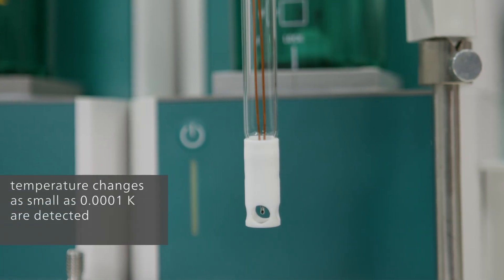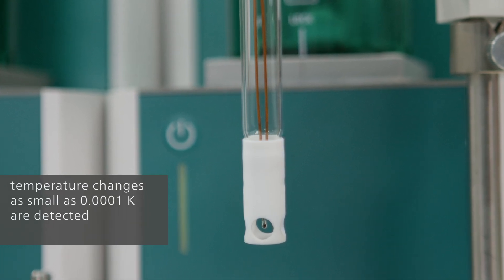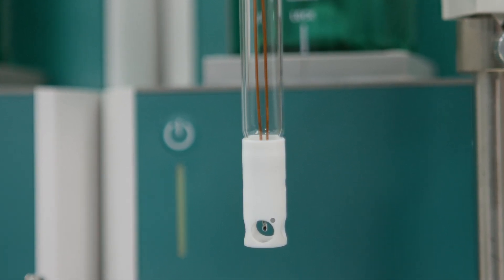Temperature changes as small as 0.0001 Kelvin can be measured with a Metrohm D-thermoprobe. This ensures extremely reliable endpoint detection.